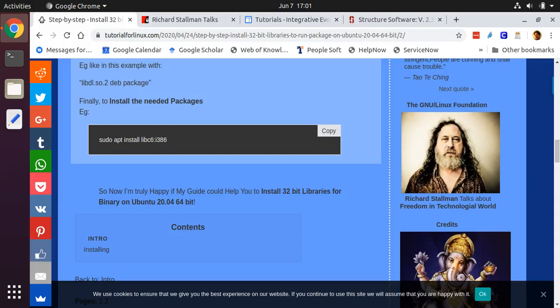This tutorial will show you how to install the program STRUCTURE for population genetic analysis on an Ubuntu Linux operating system running version 20.04. Please note that this is separate from my tutorial for installing Fast Structure on an Ubuntu Linux machine. This tutorial is for the classic version of STRUCTURE.